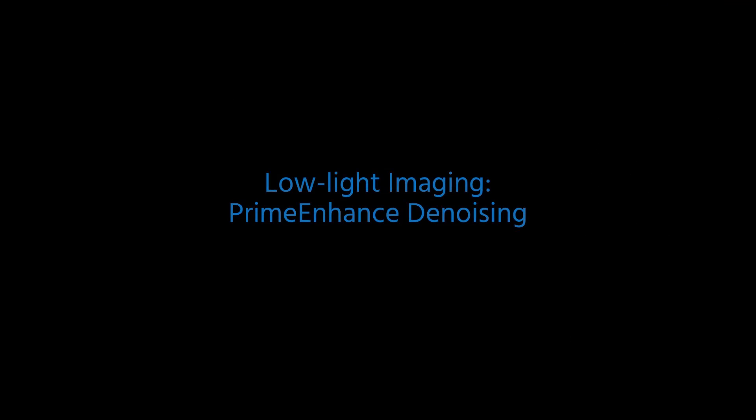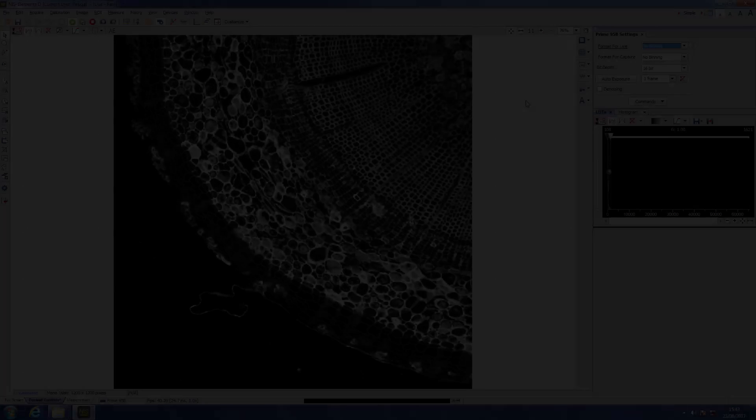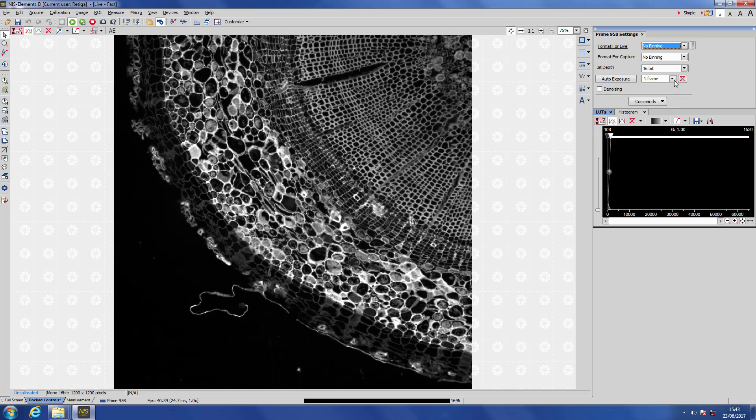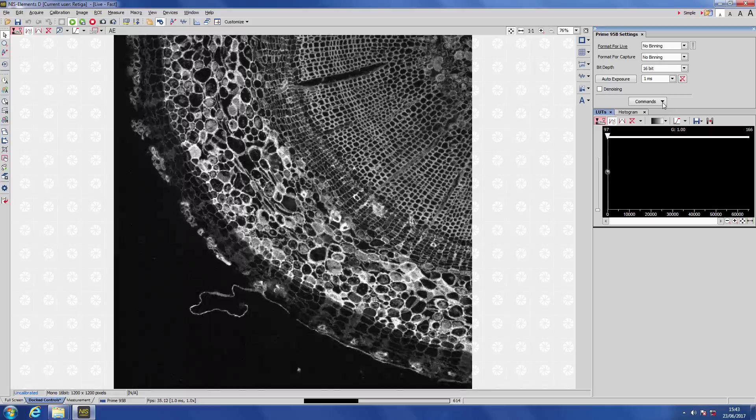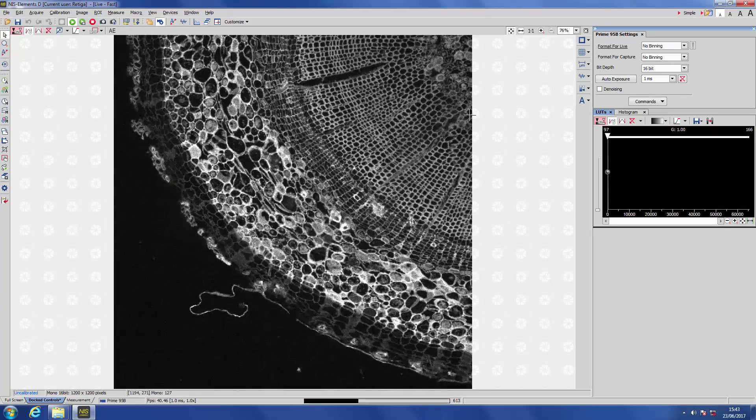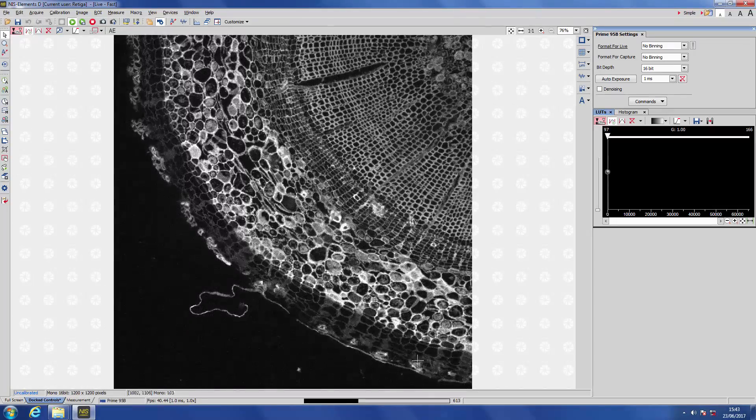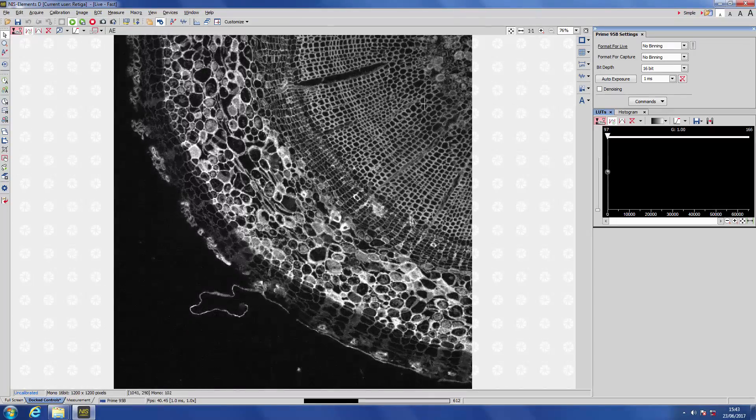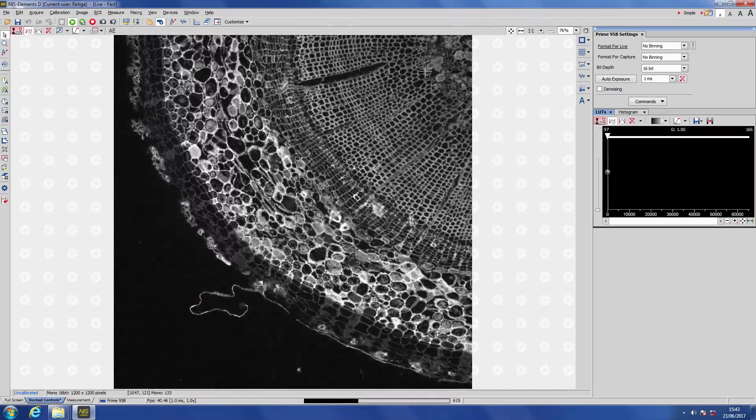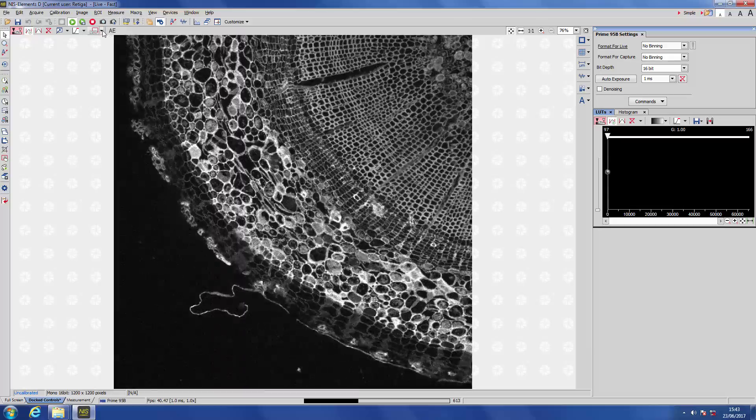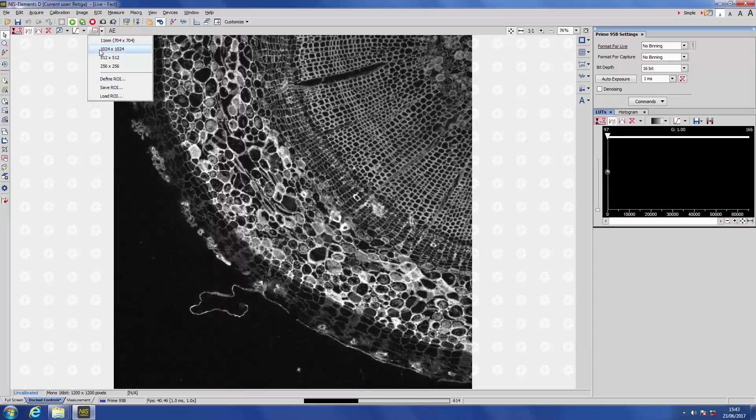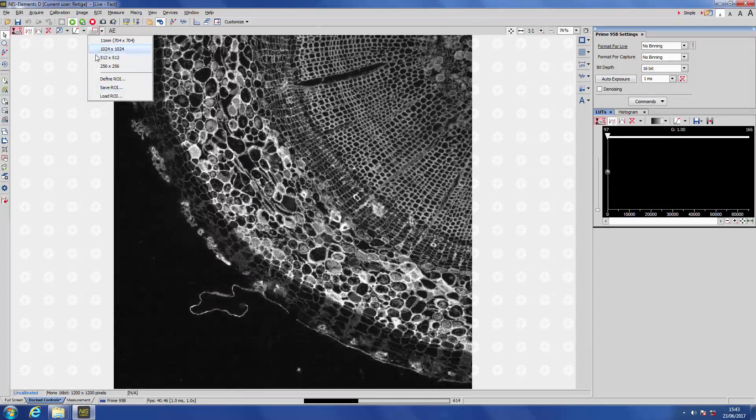Another feature that's available with the Prime 95B, for low-light imaging in particular, is our Prime Enhanced Denoising algorithm. This is an algorithm that runs on the camera head and removes some of the noise from your images. So here we have a fairly low-light image, and the Prime Enhanced algorithm will cut out a lot of the noise from a 1024 by 1024 region in the centre of the image.